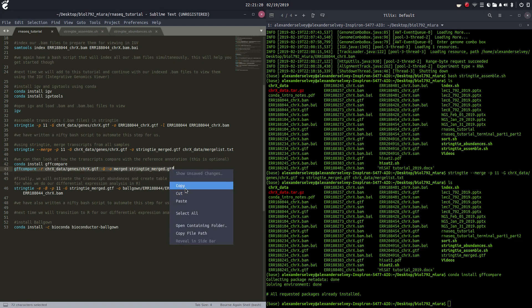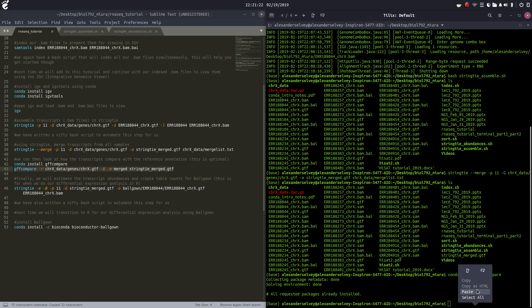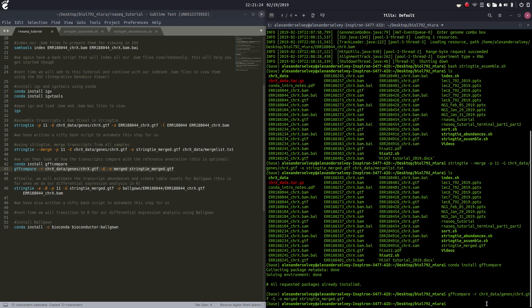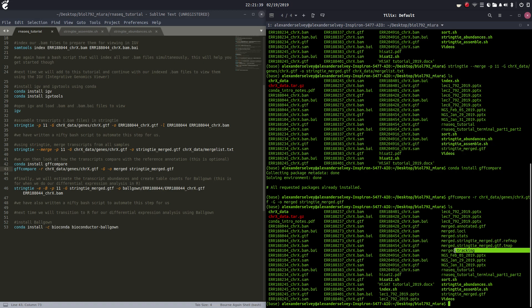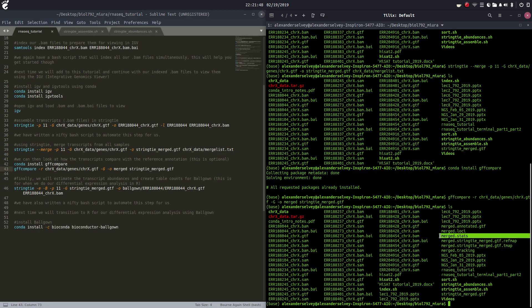Let's run this piece of code and see what we get - it's going to run super quick. Here are all of our merged outputs: gt.gtf, refmap, gtftmap, tracking. I'm not really super interested in all of them, but I'll show you what the merged.annotated.gtf and merged.stats files look like.